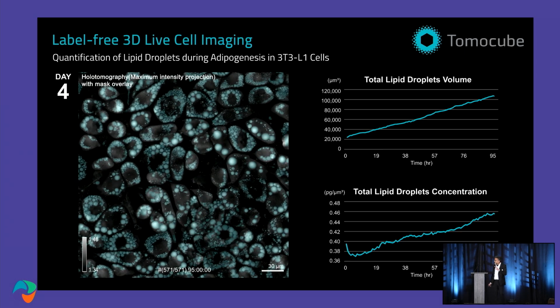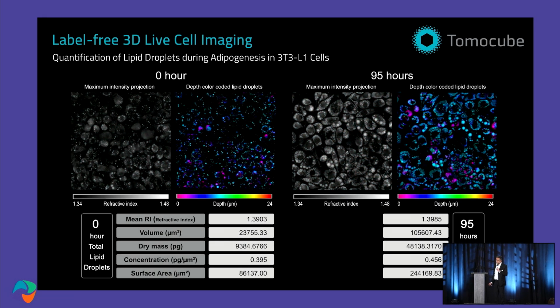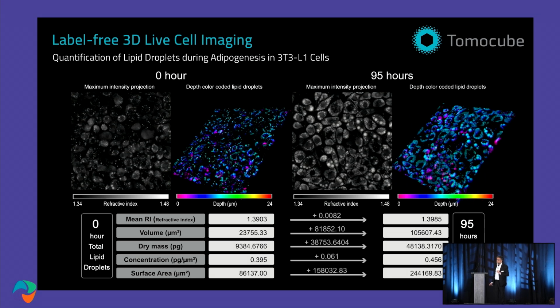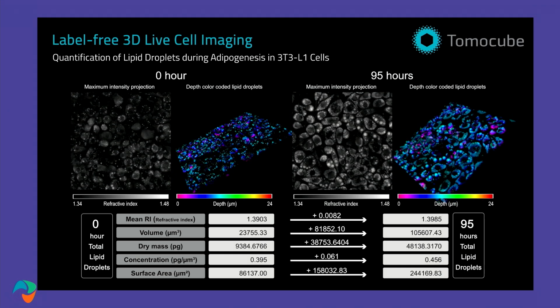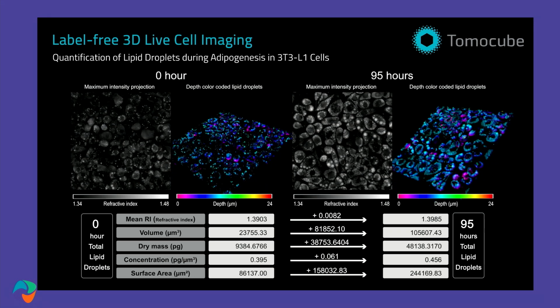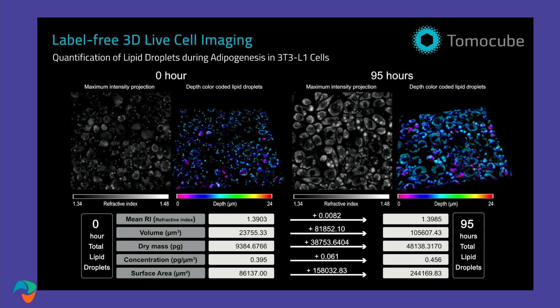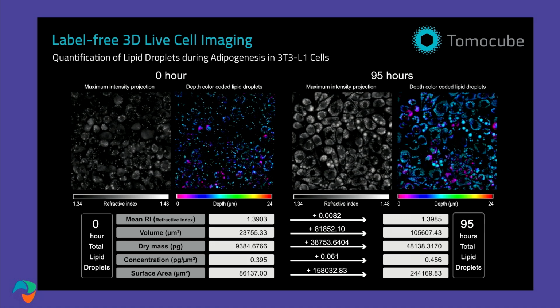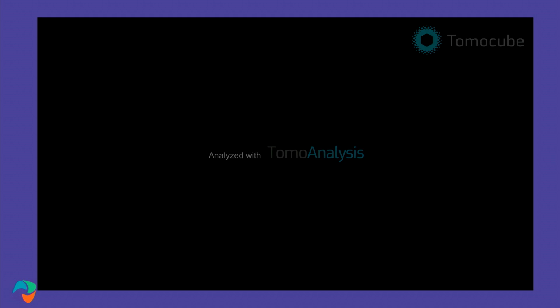And then we can identify specific time points where important biological things are happening. And then we can use something like holotomography to look at living cells and see those things actually happen. We can see the lipid droplets developing, and then we can perturb them. So fixed cell imaging and live cell imaging will complement each other to get a handle on the biology.